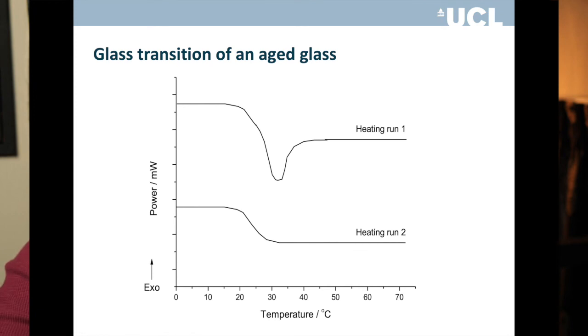So I suppose what I'm saying here is, when you're running a DSC experiment to try and understand the properties of an amorphous material, you've got to be kind of clever in the way that you set up your DSC experiment, because changing the heating rate or going through a glass transition temperature, stopping, cooling and going through it again, they're all really good ways of demonstrating: has the material relaxed? Is it a true glass transition temperature and things like that.